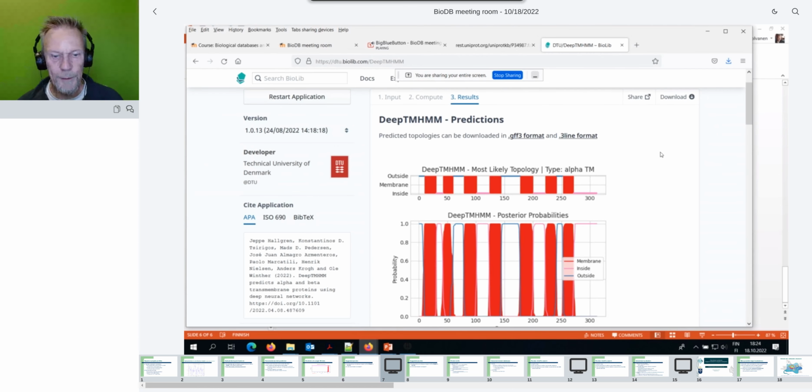I think the region which was just before amino acid 100 is the one that had the split peak. And then there were some very broad peaks, and this gives us reasonable cuts which match the typical lengths of the transmembrane helices.